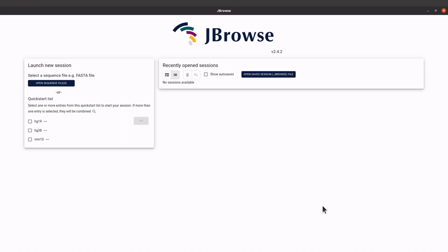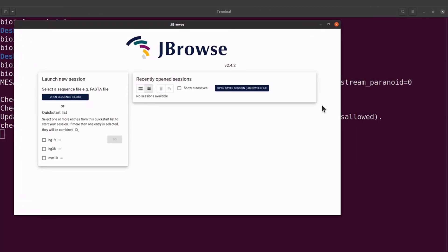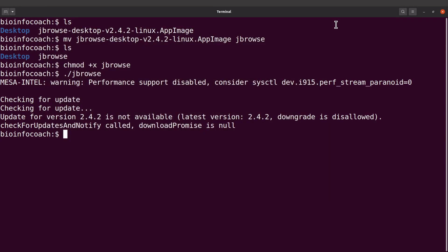Let's close JBrowse for now — we'll come back to it. We need to do some final setup and then we can test with some example data.